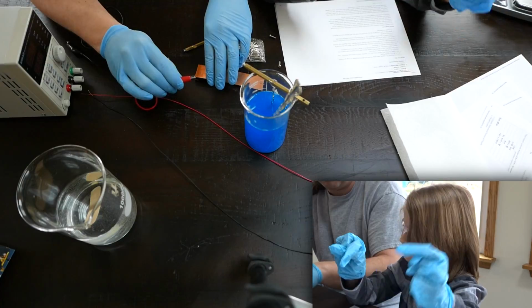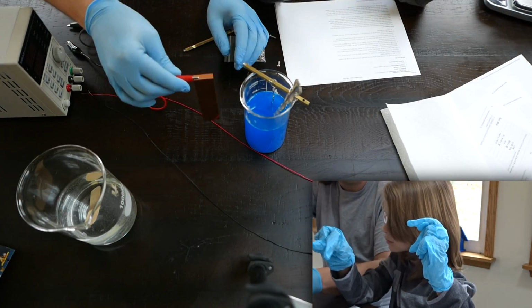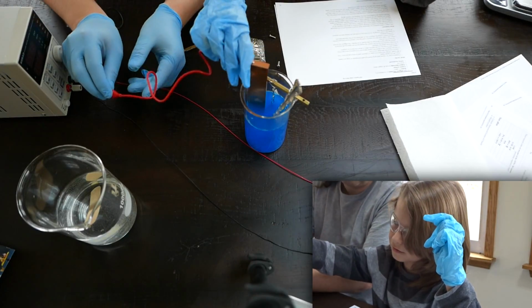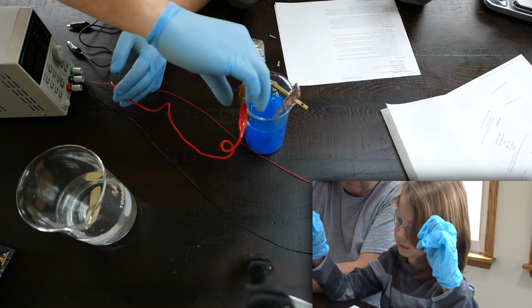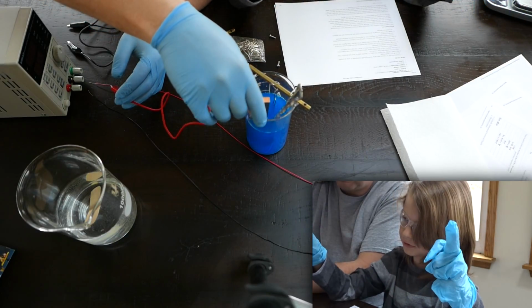Okay, you want to do that, or you want me to do it? Here, I'll do it. And you dunk it into the solution. Okay, there you go. You want to hang it off to the side, off on the side of the glass. You want to hang it, okay? Like so. And then the negative one attach.